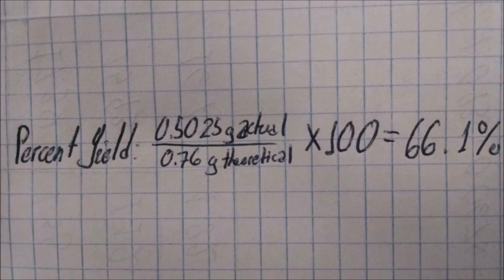Note that if the mass balance is less than 100%, some small amounts of ethanol may still be in the flat bottom flask. A lower mass balance may also be due to other reasons. Can you think of some of the other reasons for low ethanol yield?